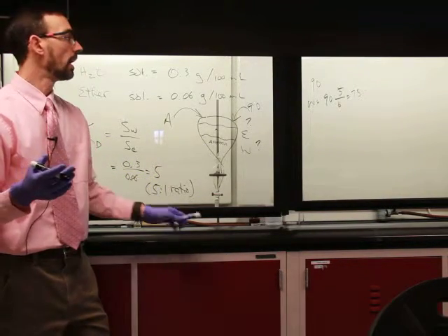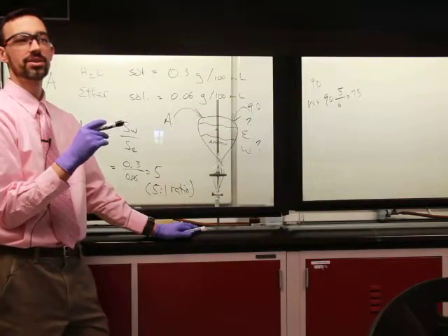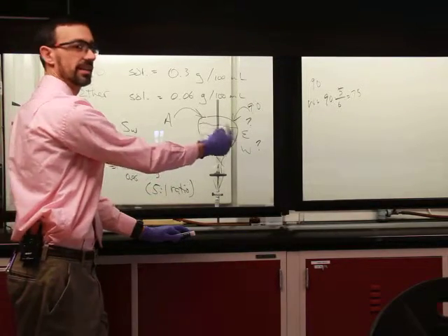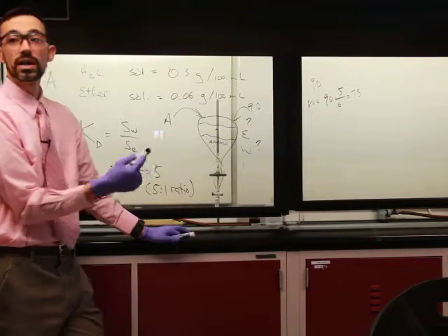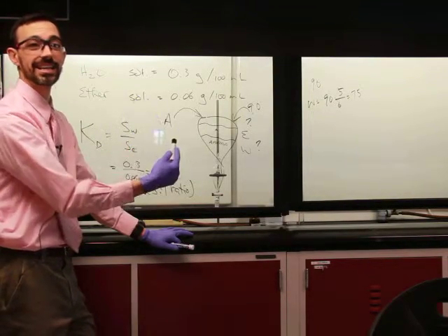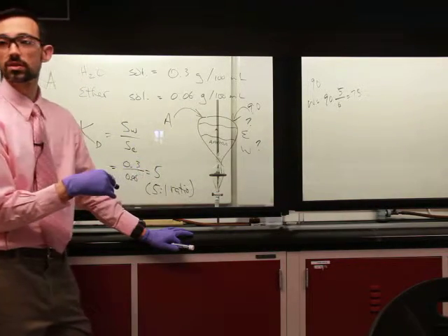But notice we wouldn't get 100% of our A out of that mixture because of this ratio. We're leaving a small amount of A in the ether. So what we often would do is repeat this technique again and again, and we would get different crops of this chemical.